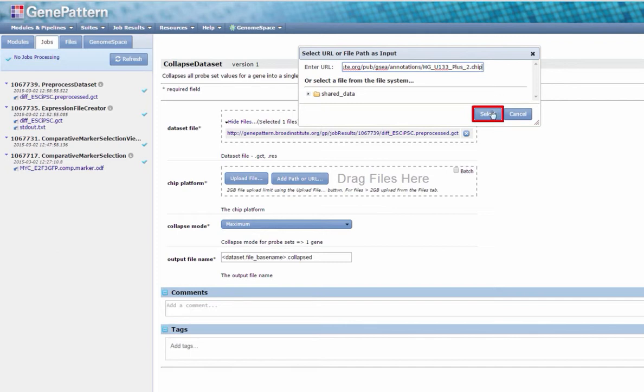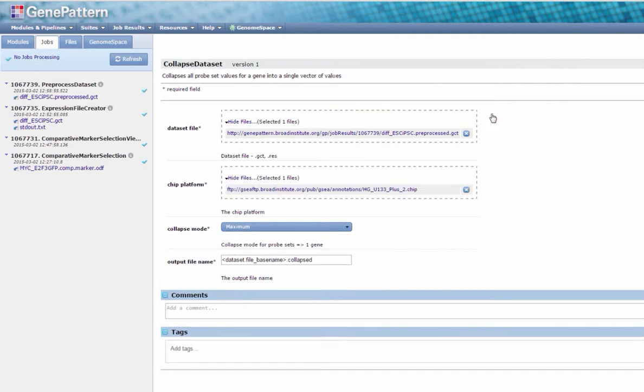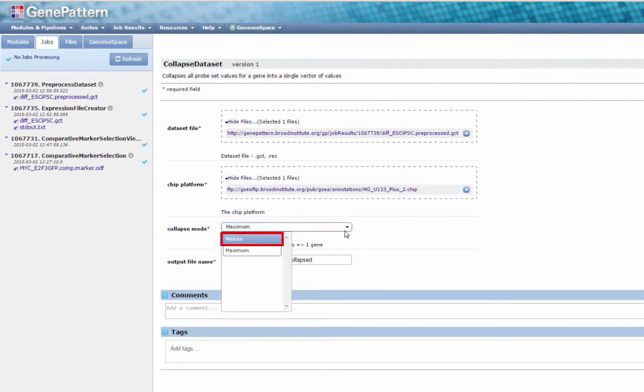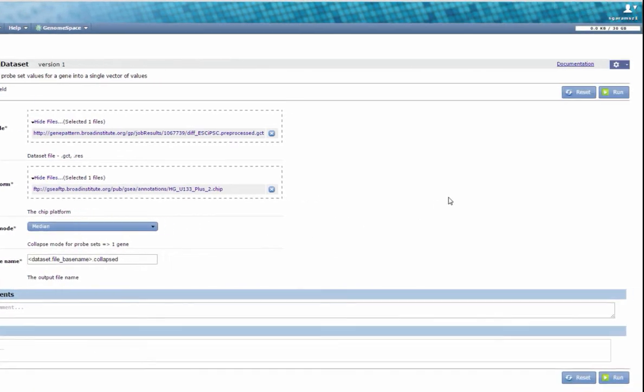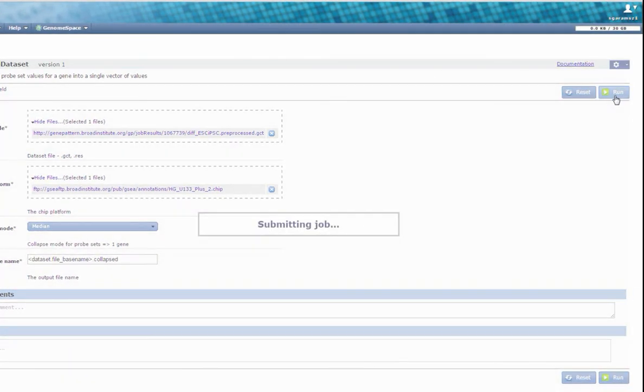Click Select. Set Collapse Mode to Median. Click Run and proceed once your job has completed.